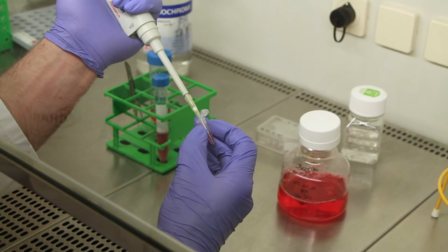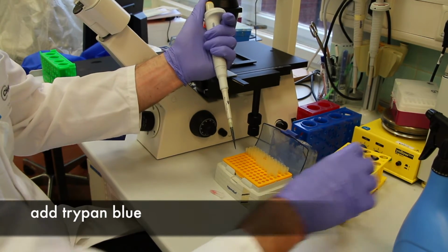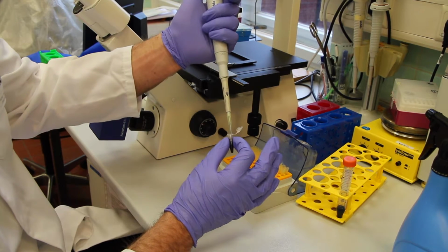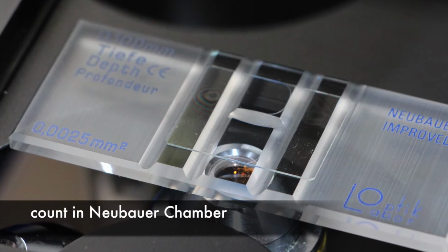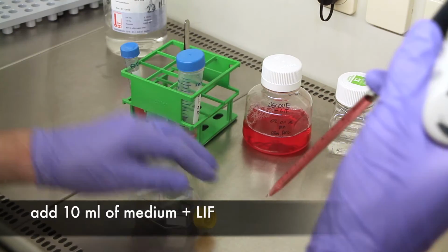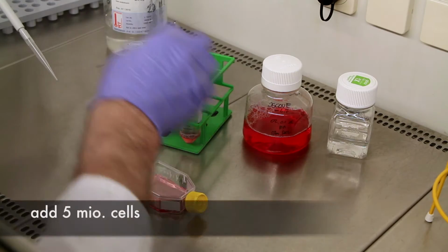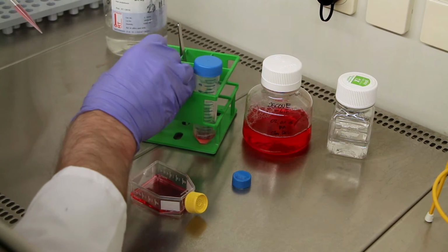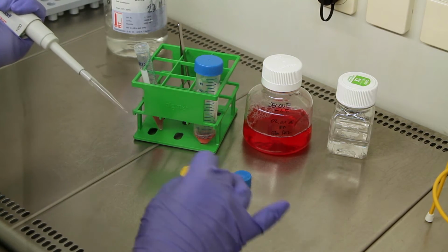Part of the cell suspension is removed and treated with trypan blue. Then 10 microliter of the suspension are added to a Neubauer chamber and counted under a microscope. For further cultivation, a new culture flask is filled with 10 ml of culture medium with LIF. Then 5 million cells of the cell suspension are added. The flask is incubated for 48 hours at 37 degrees Celsius and 5% carbon dioxide. With the remaining cell suspension, the further testing can be performed.